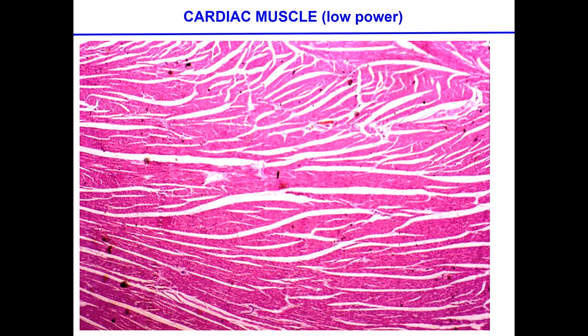You can see now the structure of the heart muscle, which gives you the impression of being fairly disorganized after you have been looking at the skeletal muscle. This is kind of messy. You can see that there are all kinds of structures, kind of spaces in between. There is a separation and branching in different locations. There is a very different organization. So if someone shows you two pictures next to each other, it's going to be very easy to identify which one is which. Questions?